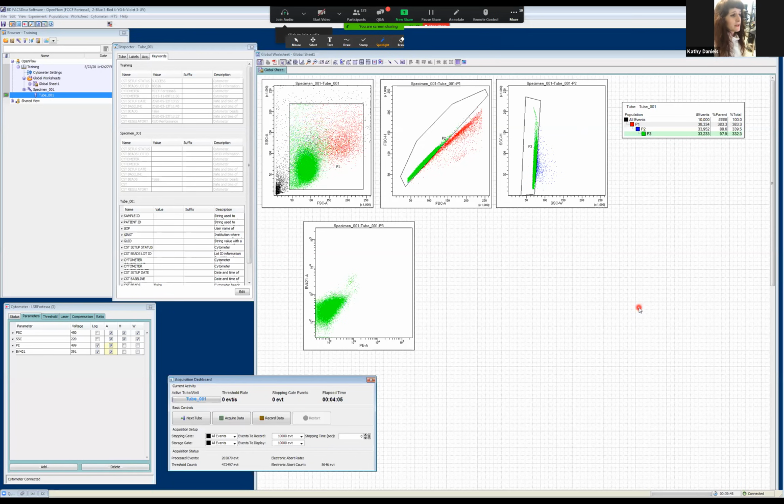Typically, that's a great question. What I recommend to people is that it's dependent on your experiment and on your cells. So I'll always explore different options of height, area, and width for forward scatter and side scatter for different cell types. It might pull out a little bit differently for your individual experiment. There's typically never a one-size-fits-all solution to flow cytometry.